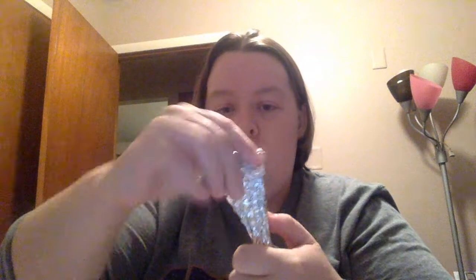So here is the sample that we have collected of our waste from the Acme Widget Company, and our goal here today is to figure out if ruffinotoxin is present in this waste. There are a few questions to answer before we actually get started. Go ahead and pause, and on page 2 of your lab, answer these questions.